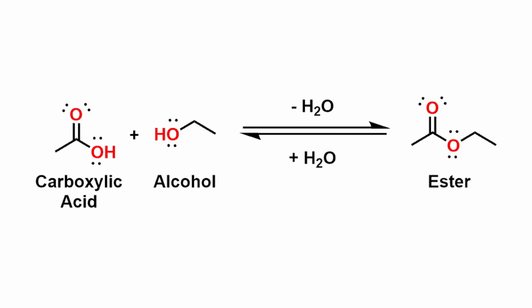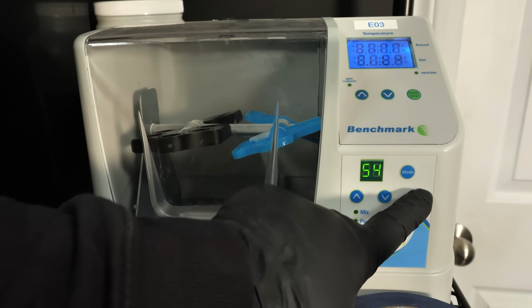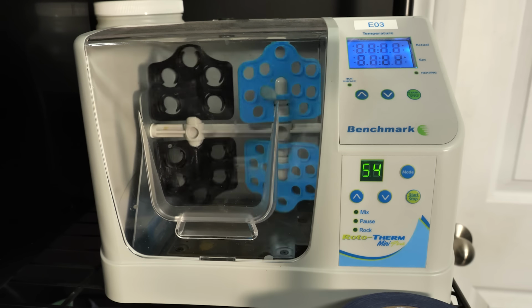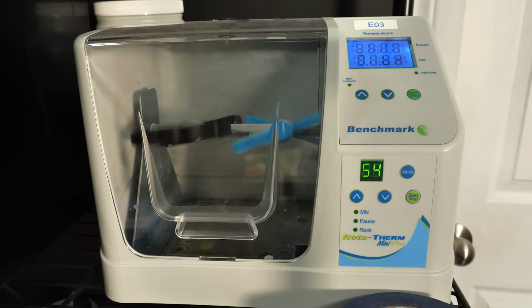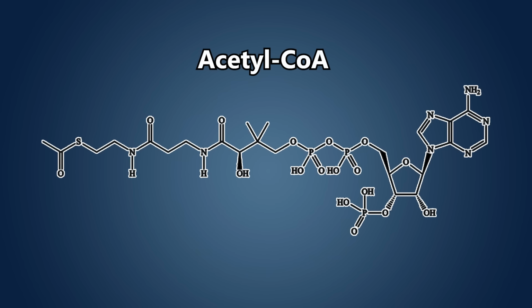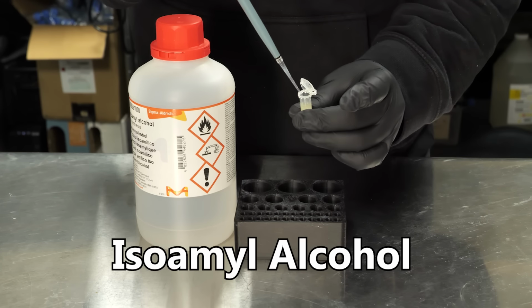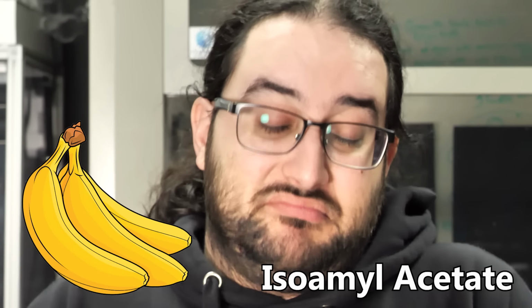Making esters like this is a classic high school chemistry experiment, but normally requires concentrated sulfuric acid and a reflux setup amongst other things. But by expressing the enzyme in E. coli, I can do the same reaction, but instantly and in a tube. If I inoculate a tube with the modified E. coli and then let it grow for a few hours, the E. coli will have produced a ton of the enzyme, and importantly, plenty of the special acetate reagent that's also needed, called acetyl-CoA. When I add a few drops of isoamyl alcohol to the tube and then give it a shake, within a few minutes the tube will start smelling pleasantly like banana as isoamyl acetate is formed.